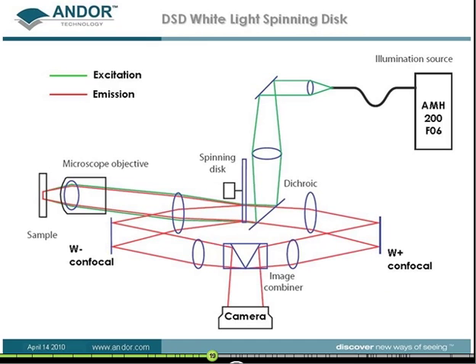Last year, I showed this chart that shows the optical configuration of the instrument. It's kind of hard to get a grip of initially, so in the following slide sequence I'm going to show you in a moment, we've developed a solid model of the device, and we'll show you where the light actually goes in the physical instrument, and hopefully that'll be a bit clearer.